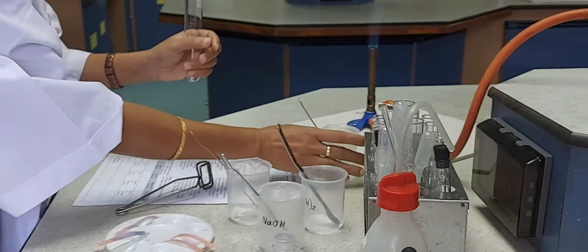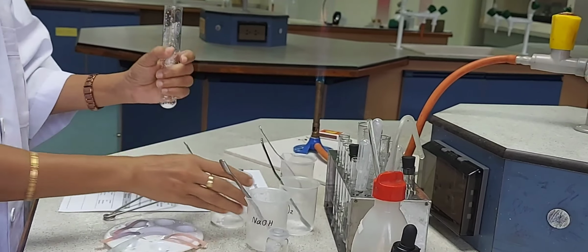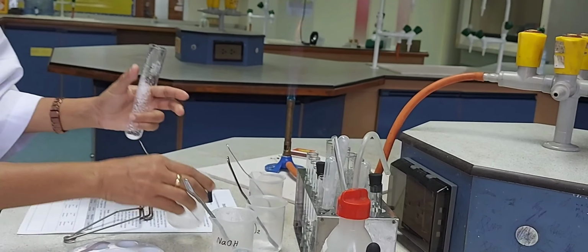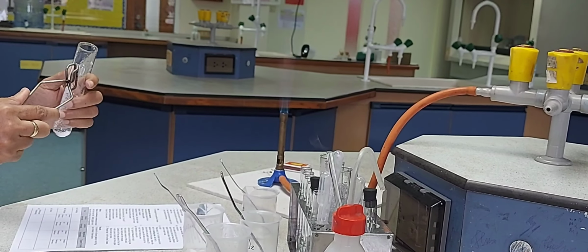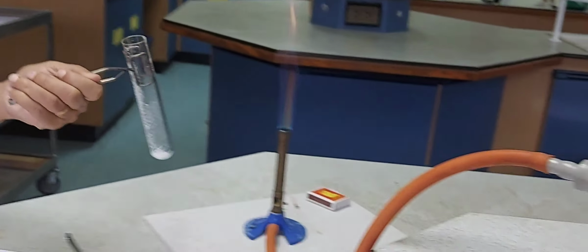Into the next, take ammonium chloride, 1 spatula measure, and I will be adding barium hydroxide, and gently heating the mixture.